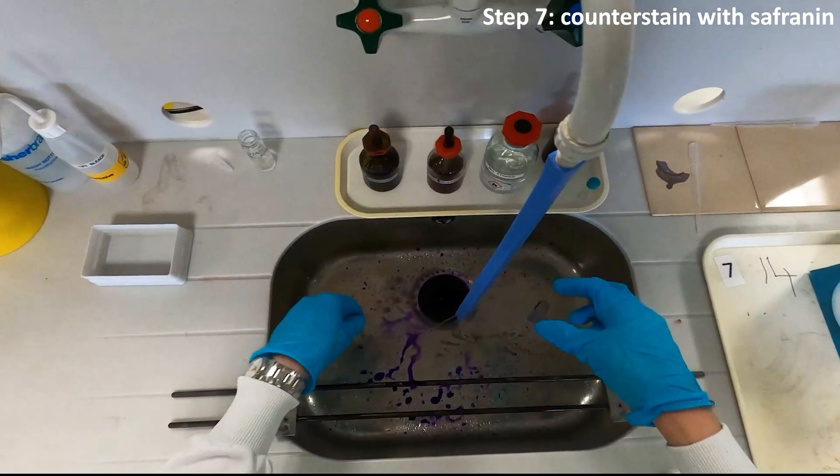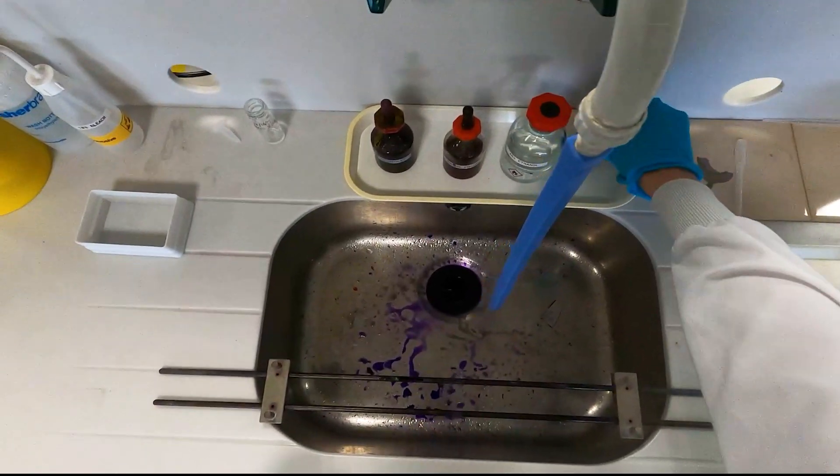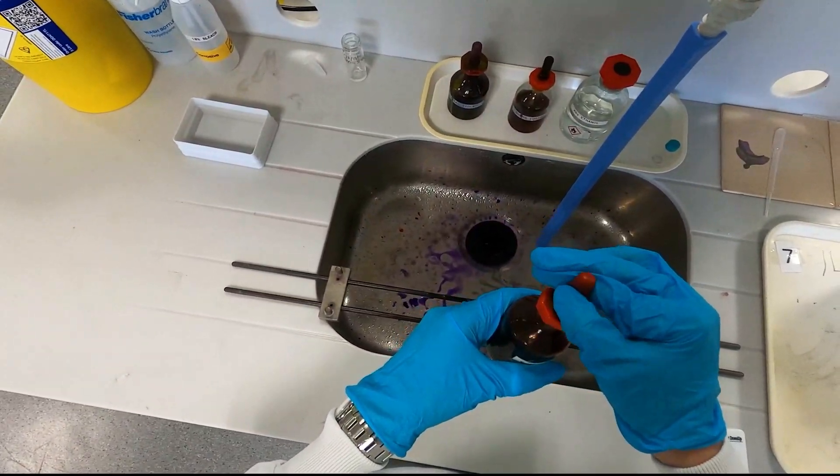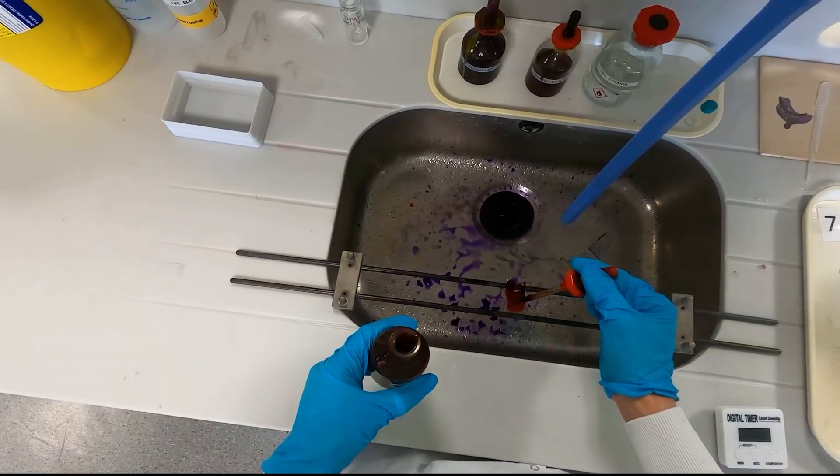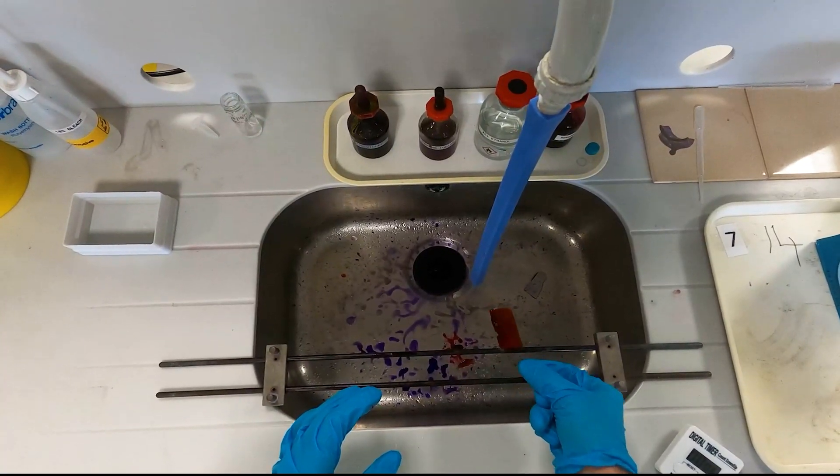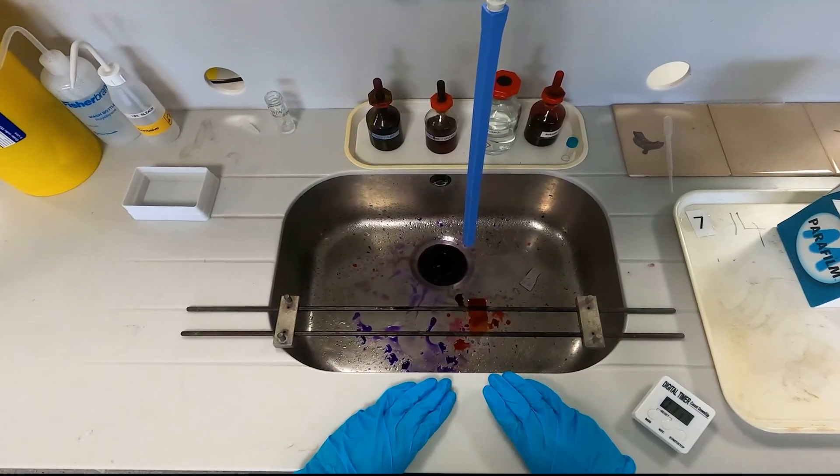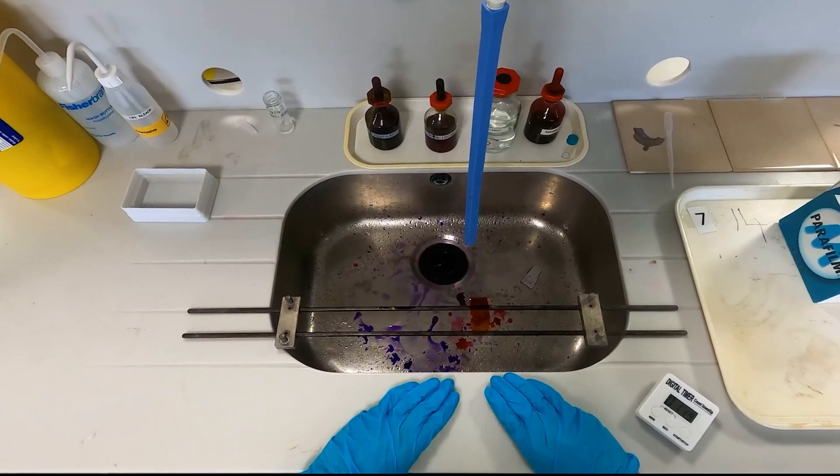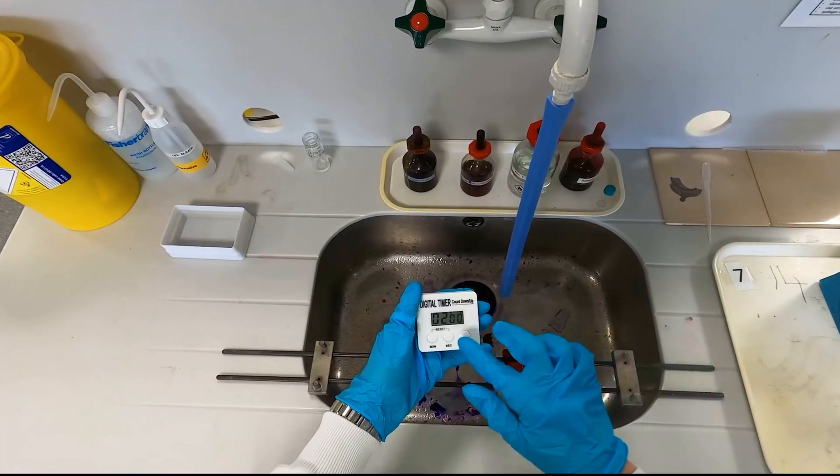Finally add a few drops of your counter stain, safranin. If your bacteria is Gram negative, this stain shows up clear in the crystal violet giving it a bright red or pinkish color, but if your bacteria is Gram positive, the crystal violet will show up clearer and look purple. Now you've just got to wait a very long and very boring two minutes.